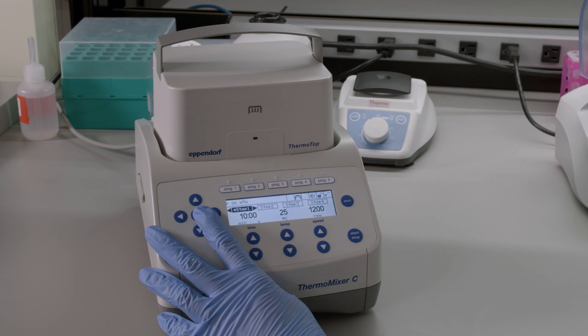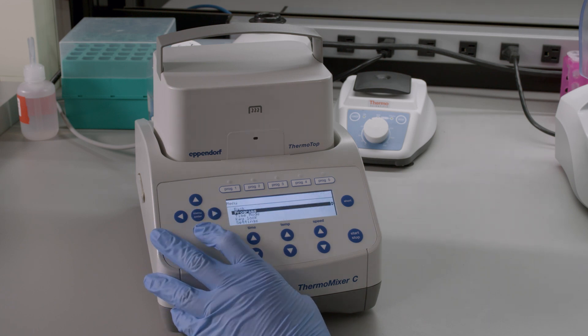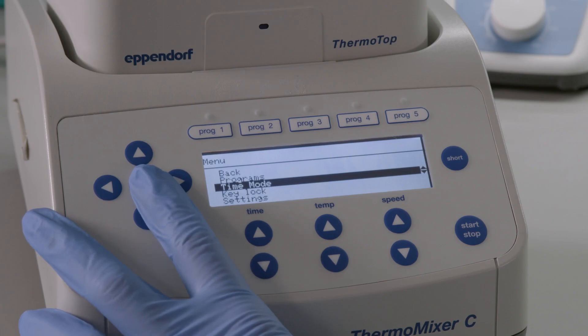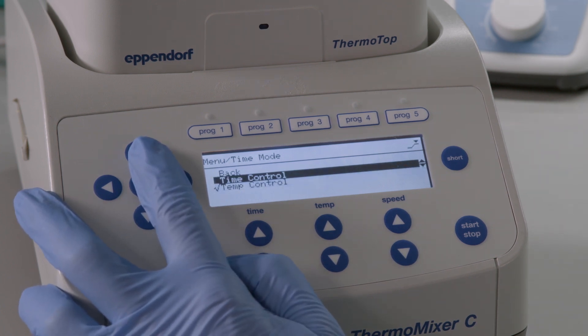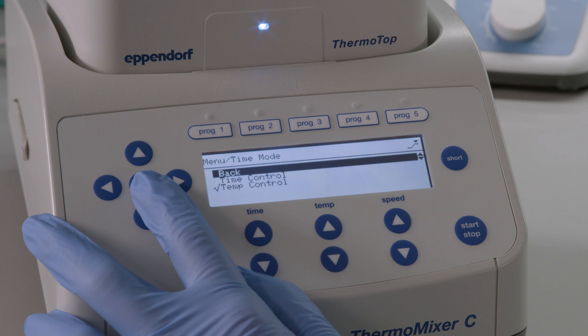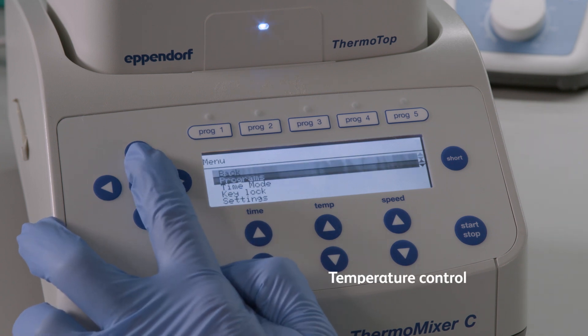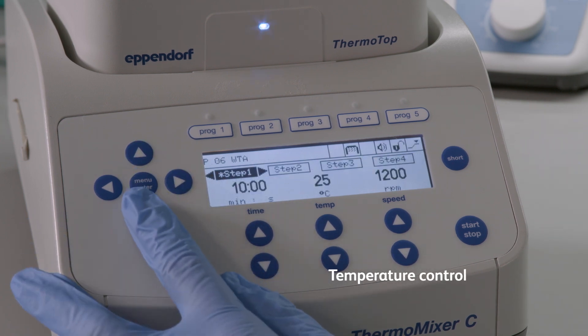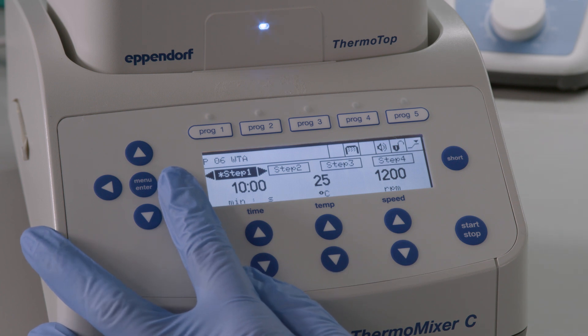In the next step, slowly raise the temperature of the reaction mix to produce a copy of the cDNA covalently linked to the bead. Before starting, make sure to set the ramp rates on your thermomixer at the maximum and set the time mode to temperature control. Incubate this reaction mix using four specific steps which will all include shaking at 1200 RPM.